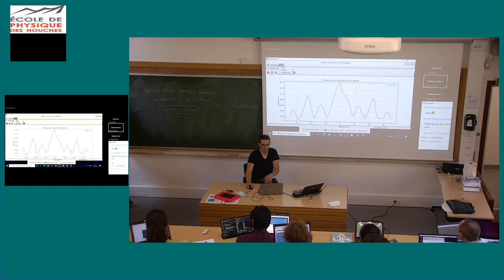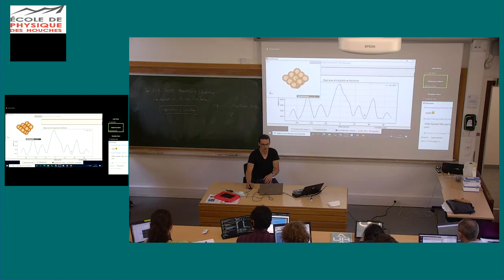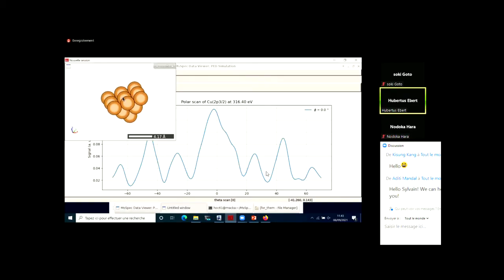And in this view menu, you have also the cluster. So it is somehow the same kind of viewer as the AEC one. You can view your cluster, so you can rotate it by holding the right mouse button and moving the mouse. You can translate it with the left button. And if you hold down the control key and use the mouse wheel, you will make all other atoms transparent but the absorber one. It is easier for you to locate the absorber atom. Okay?